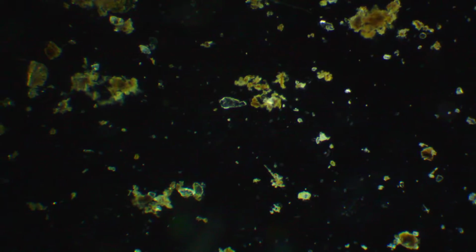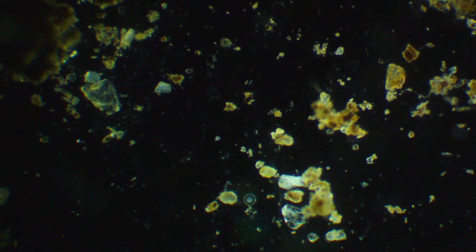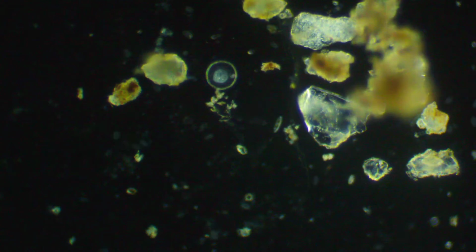And this is the dark field setup on the microscope because, ooh, look at that, looks like a little egg. It looks like an egg. I've seen these before too. I don't know if they are eggs. They look like eggs to me. It's kind of what I imagine a tardigrade egg might look like, but it's hard to know for sure if that's an egg or just a water bubble.